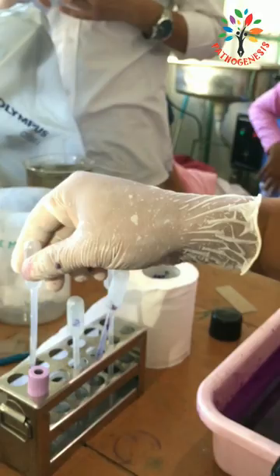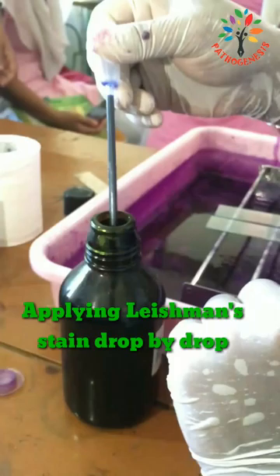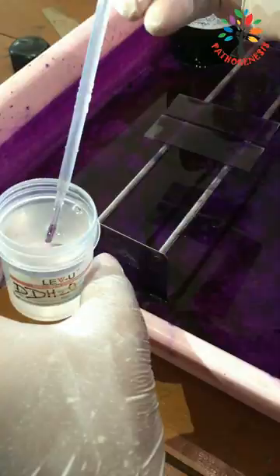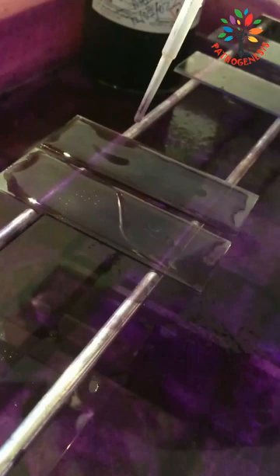Next, moving on to the Leishman stain procedure. Cover the air-dried thin blood smear with Leishman staining solution by counting the drops of Leishman stain. Let it stand for one to two minutes. During this period, the methanol present in the stain fixes the blood smear. After that, add double the amount of distilled water and mix the content by rocking or blowing gently.